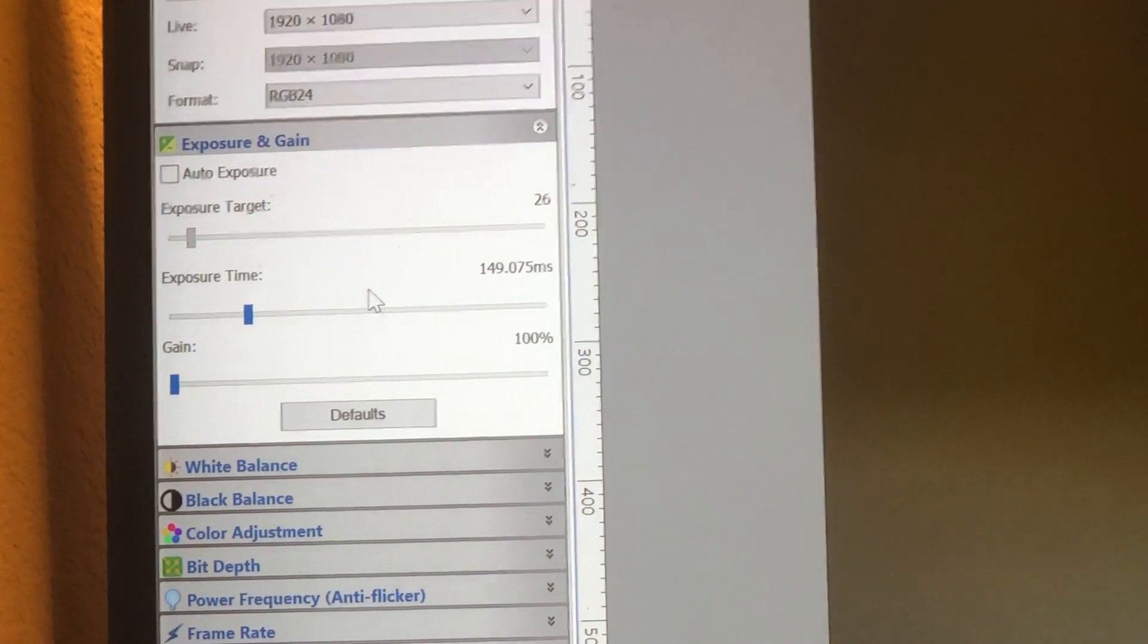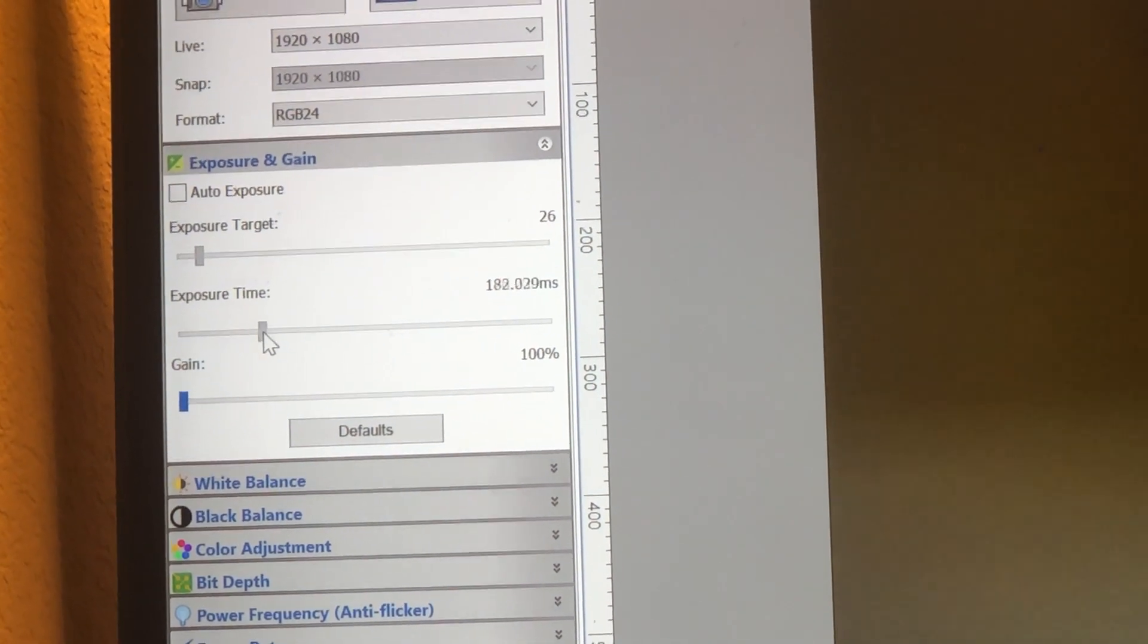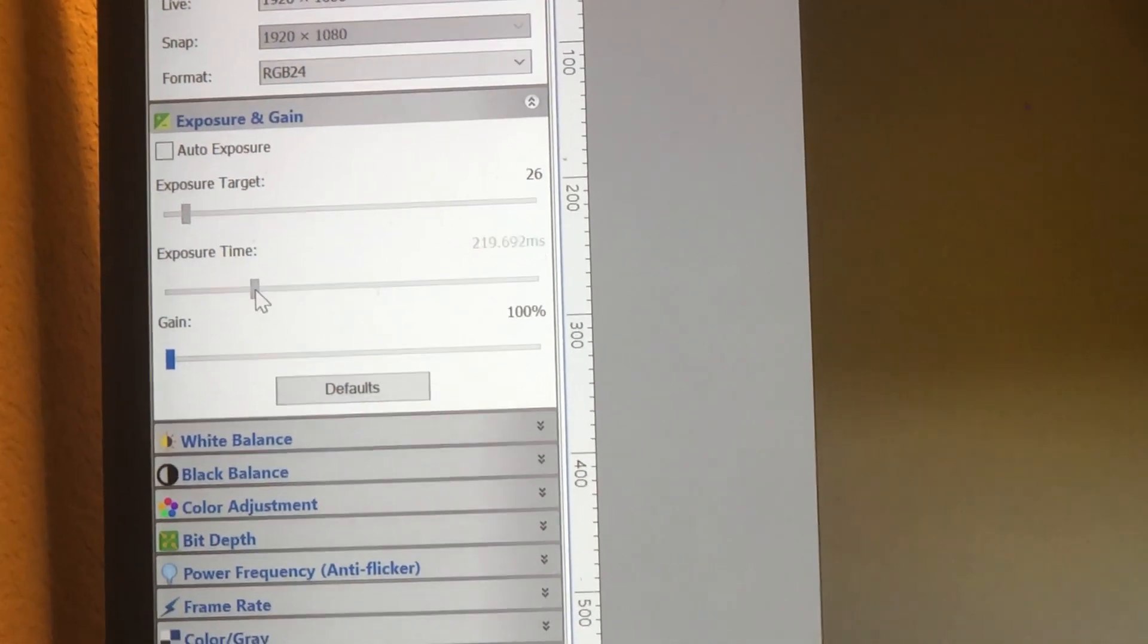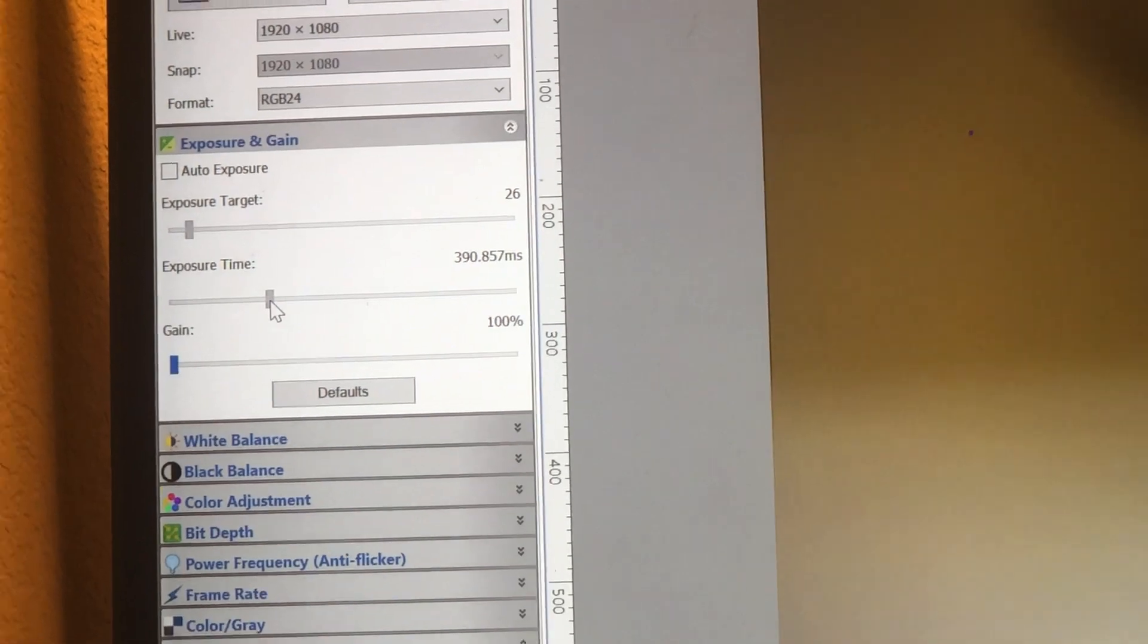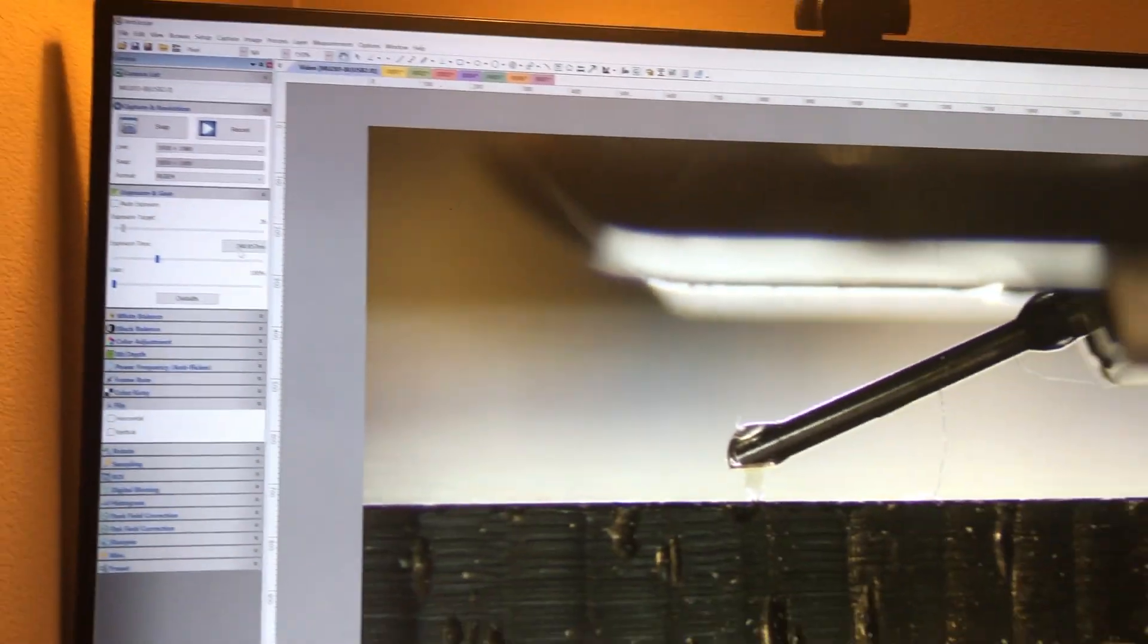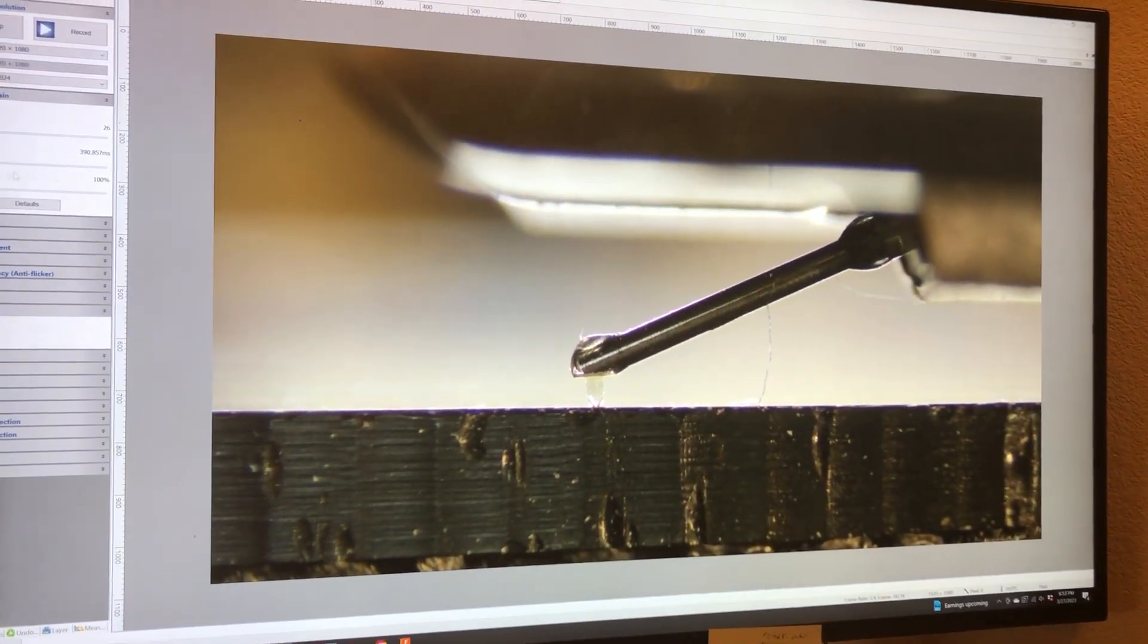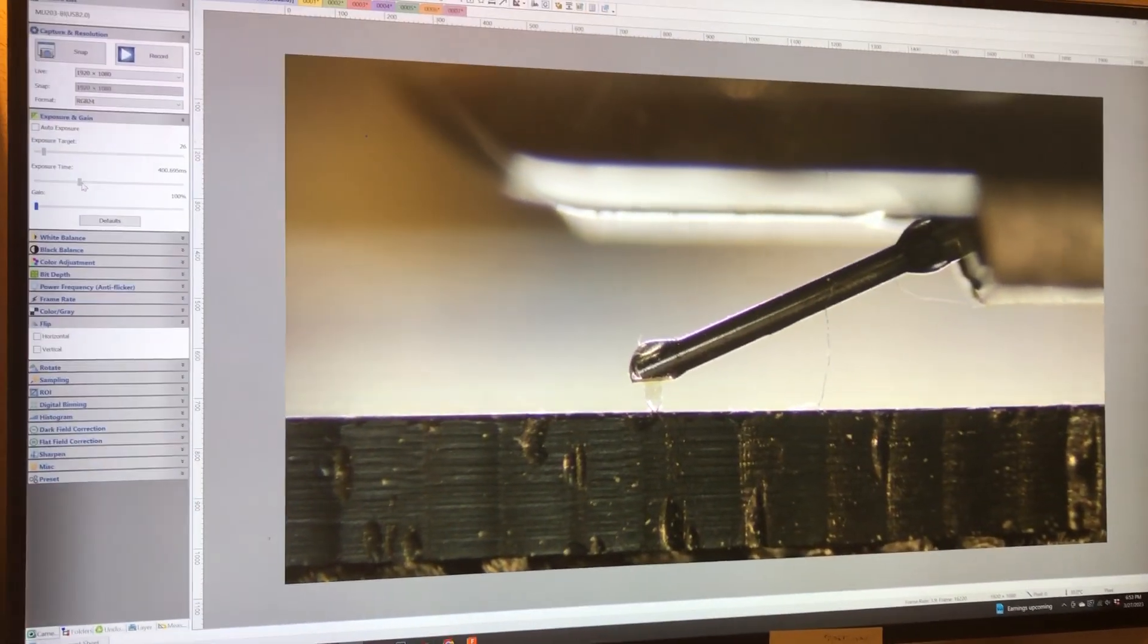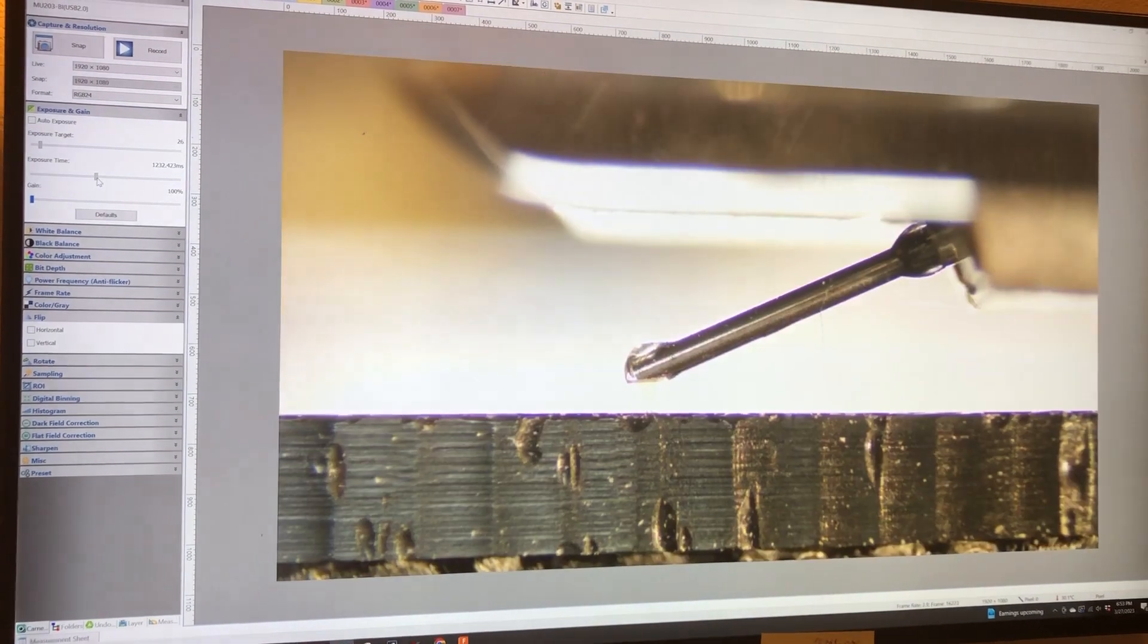Now the longer I'm dragging it out here and I'm increasing exposure time to 390 milliseconds, as I do it you can see the picture is getting brighter and brighter.